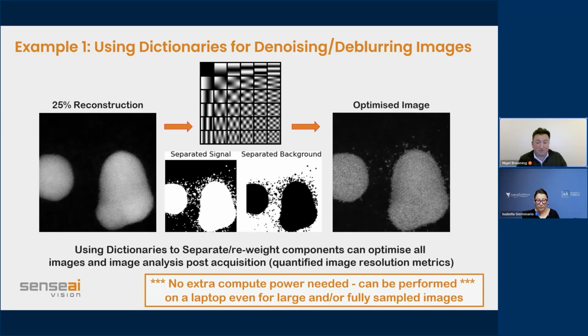Obviously, the benefit is to be able to make the acquisition optimal, and fixing an image that's already been acquired. In a lot of cases, all you do is find out that the image wasn't acquired in the best way that you can do it, and you can't overcome distortions caused by defocus, astigmatism, just lack of signal. There's a limit to what you can overcome, but it still works, and it still does provide, in many cases, an improvement in the signal quality that you can get.